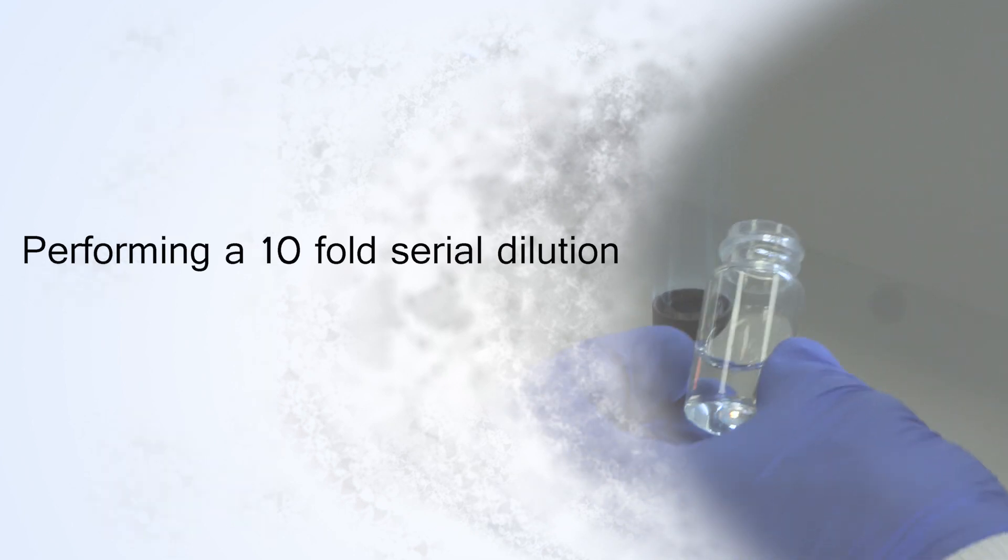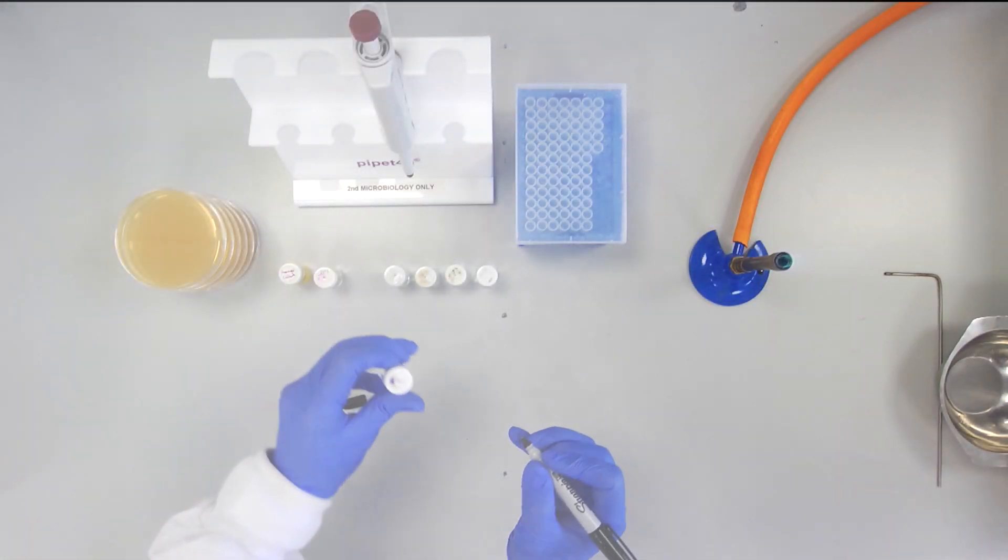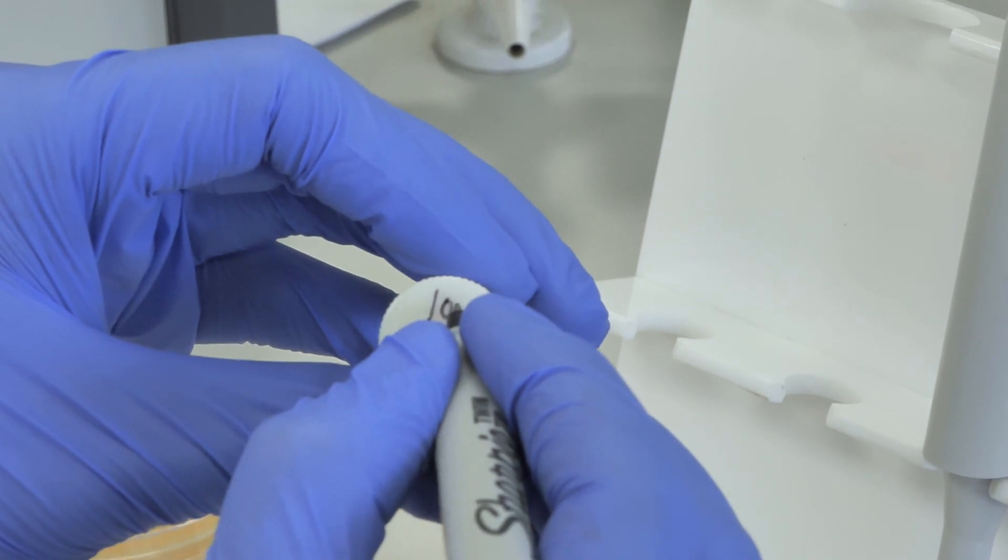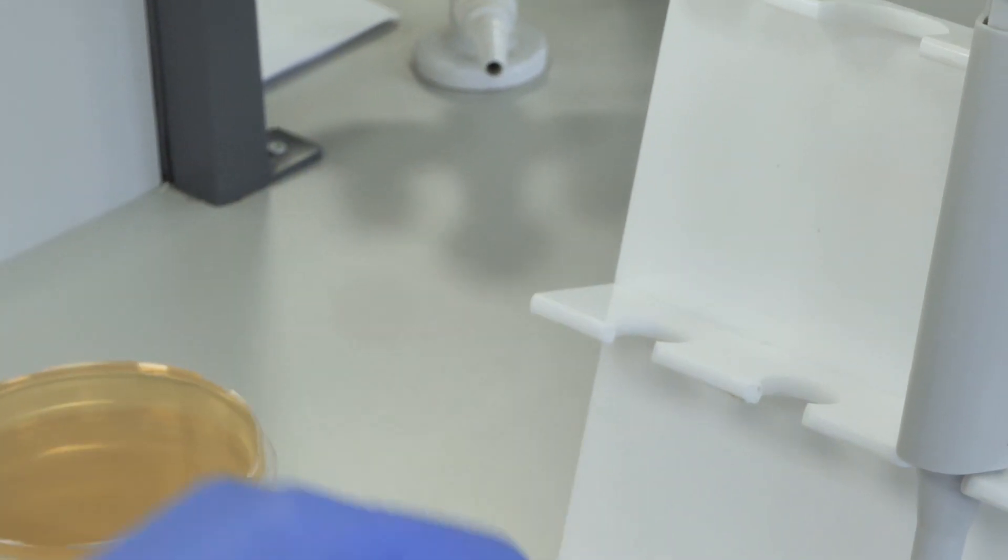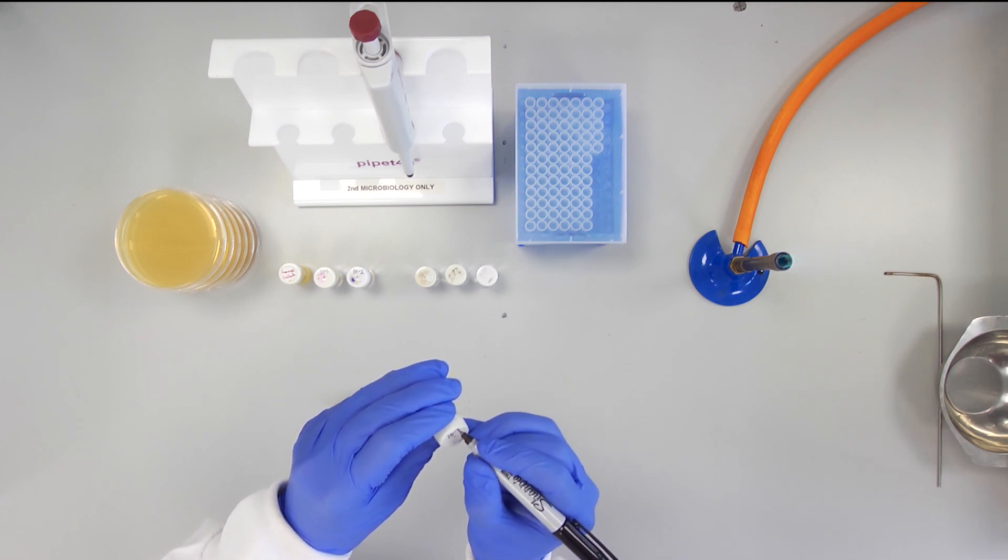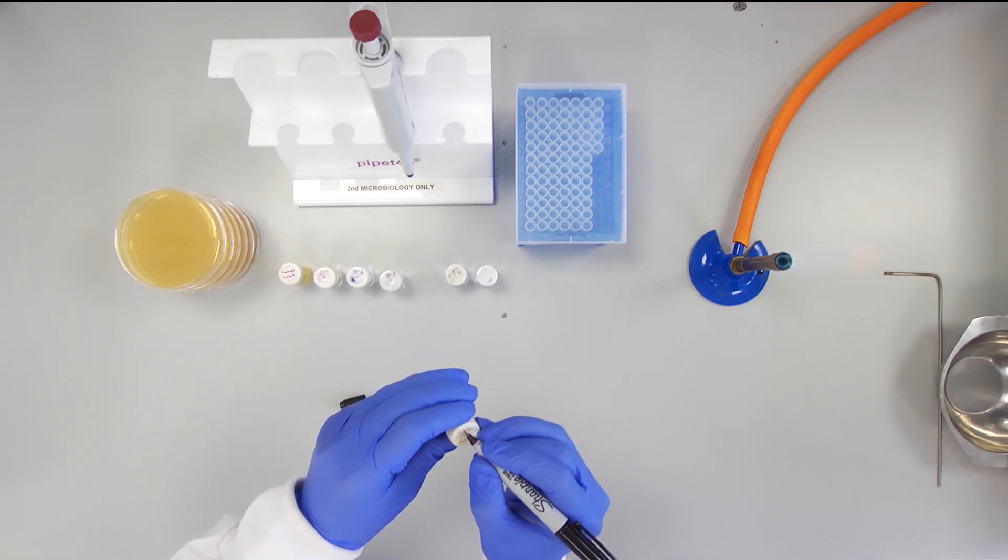Performing a tenfold serial dilution. Good organization is critical to the success of this experiment. In order to perform the serial dilution and spread plating to ascertain the number of bacteria present in an overnight culture, the following is required.